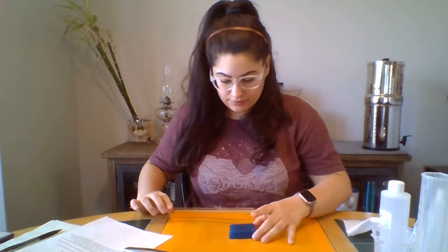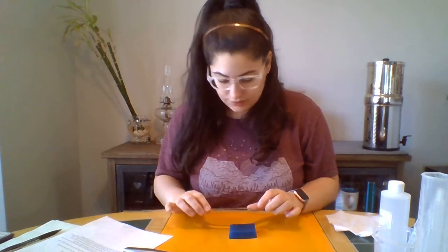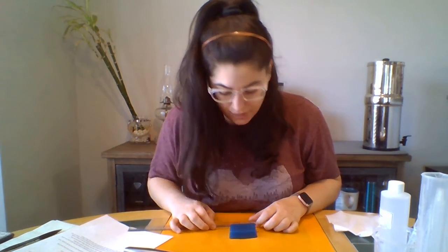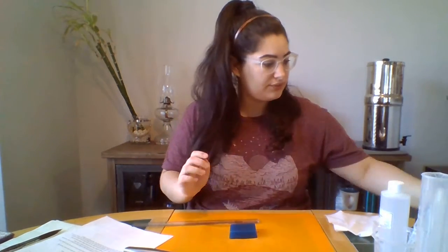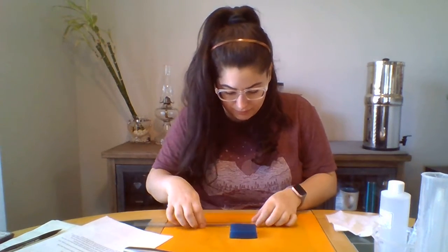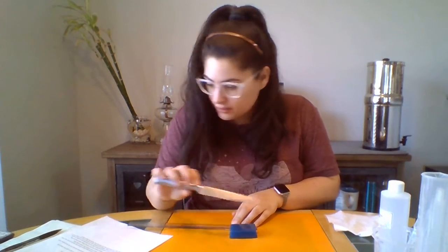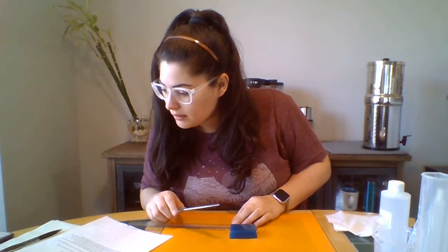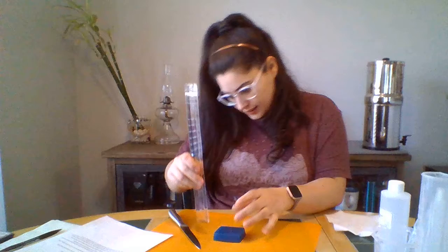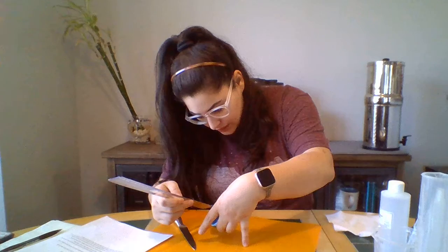Okay. So it said it's helpful to measure the 6 centimeter side of a block first. That would be this side. Oh, interesting. So it's kind of not a completely rectangular shape because it does get smaller as it goes up, but I would just measure from the bottom to get the 6 centimeters. Okay, so 6 centimeters long, 1 centimeter by 1 centimeter. And I'm guessing this is 1 centimeter. Okay, so it's a little bit over.